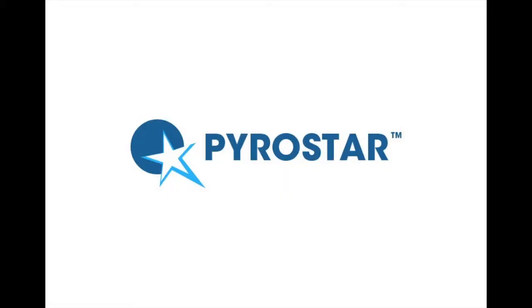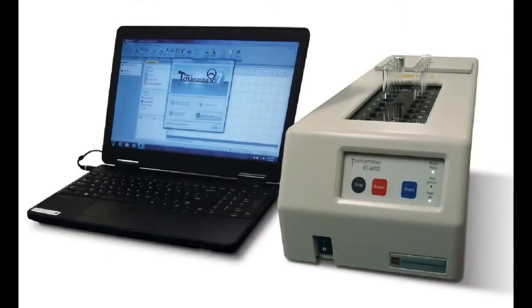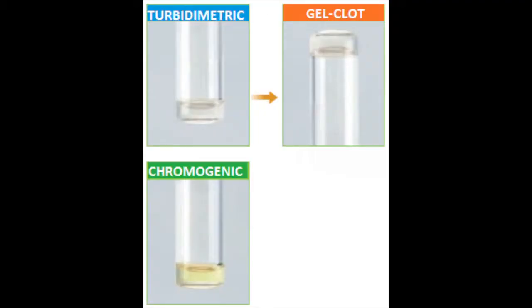The Pyrostar ESF series of reagents represents our uniquely endotoxin-specific line of LAL products. Our LAL products are formulated to be used either qualitatively as a gel clot reagent or quantitatively as a kinetic turbidimetric reagent. The Toxinometer ET6000 allows for measurement by turbidimetric, chromogenic, or gel clot method.